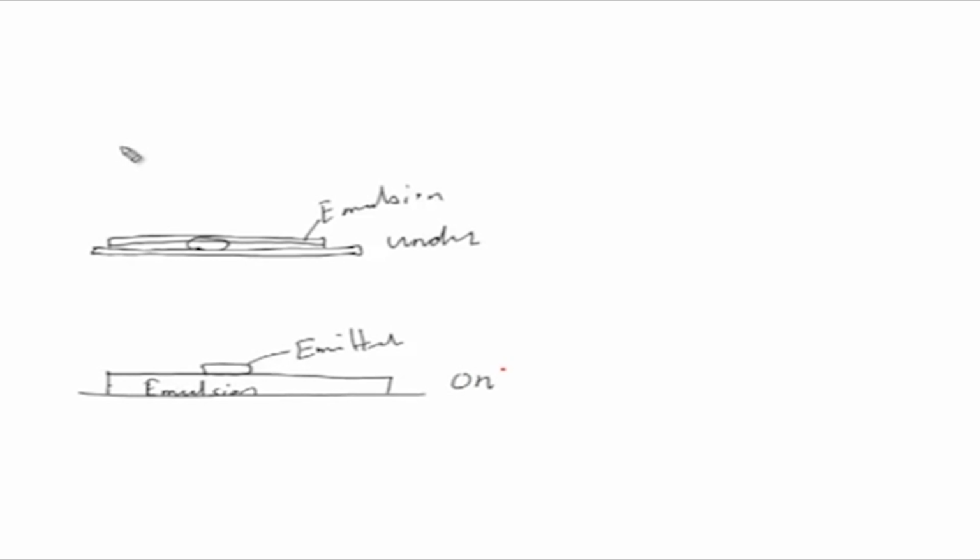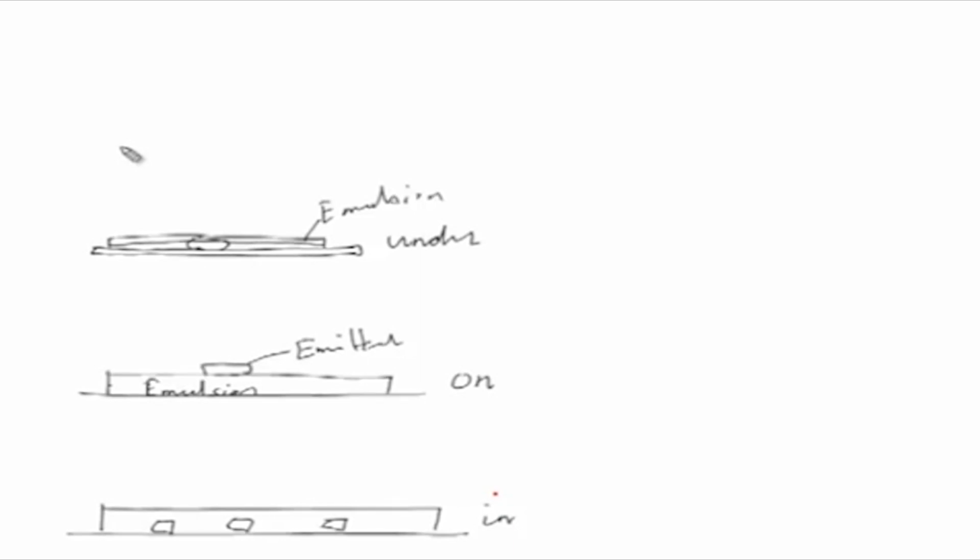There could be a third condition where you have emulsion and your radioisotope is distributed in it, so the emitter is in the emulsion.